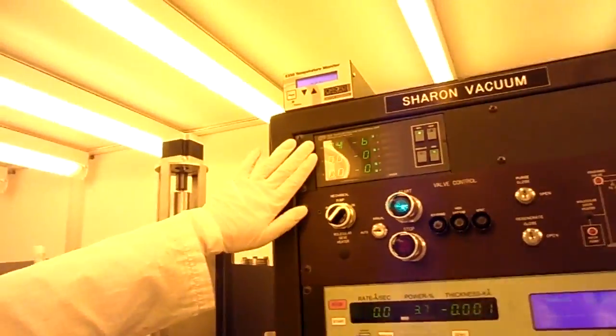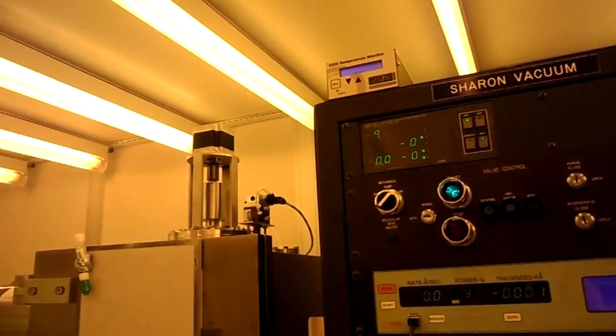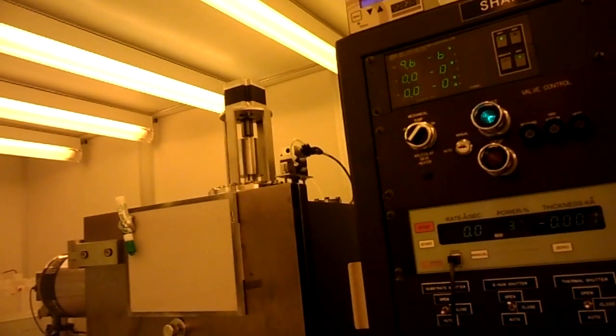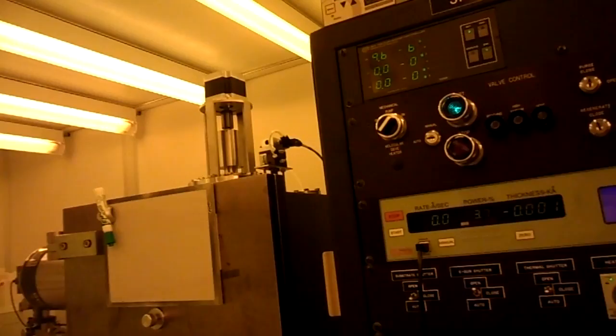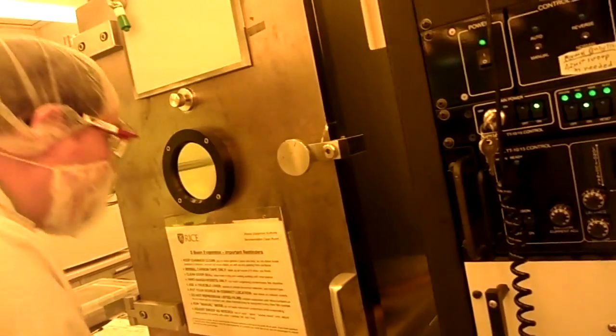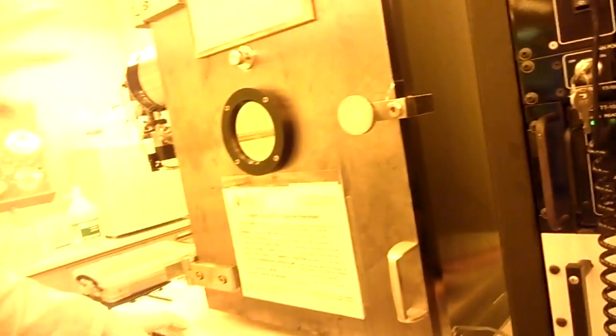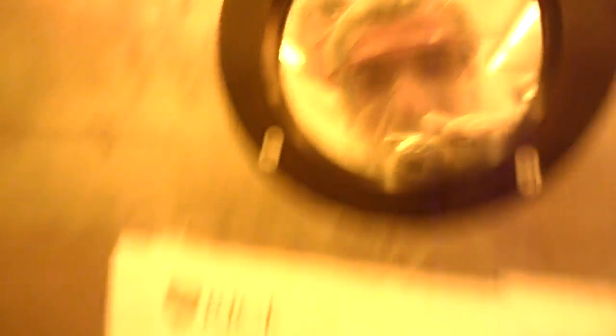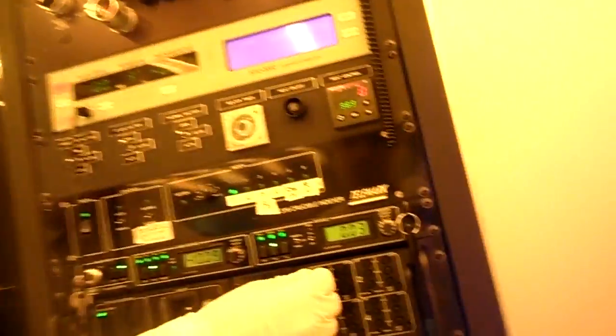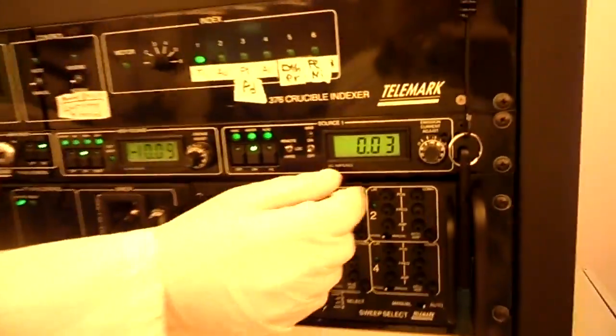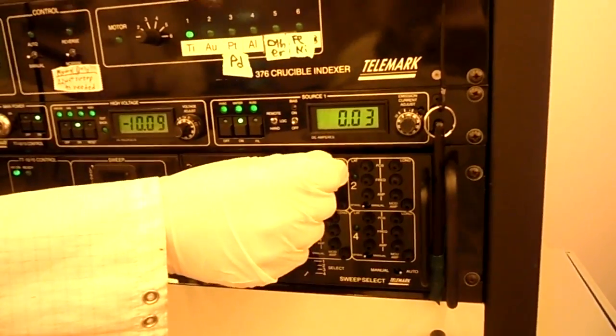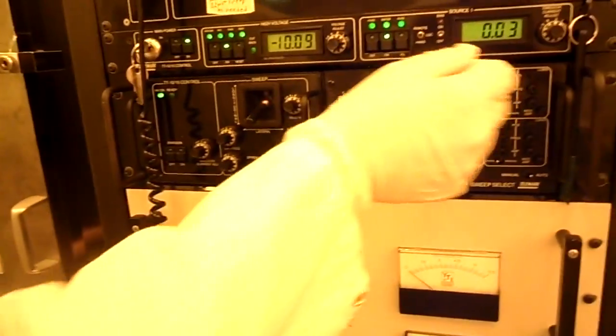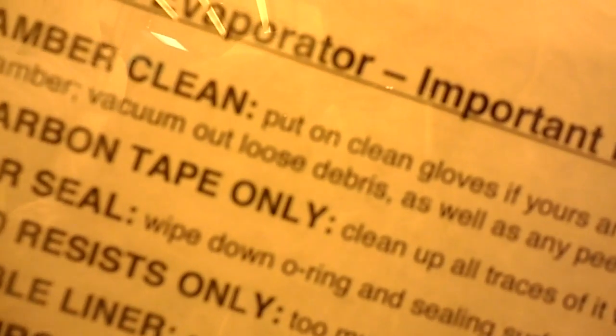Yeah, you can see it very well now. So, it's hot titanium. And you can see also, the pressure is getting worse, right? And that's because we're cooking off oxide and water vapor and things that are on the surface of our titanium. Now, you see the light is actually kind of flickering. You see that now? On the surface of the titanium. What I want you to do is look in there and adjust these top two knobs. You can just go back and forth with them. And see how latitude and longitude affect the position of the beam.